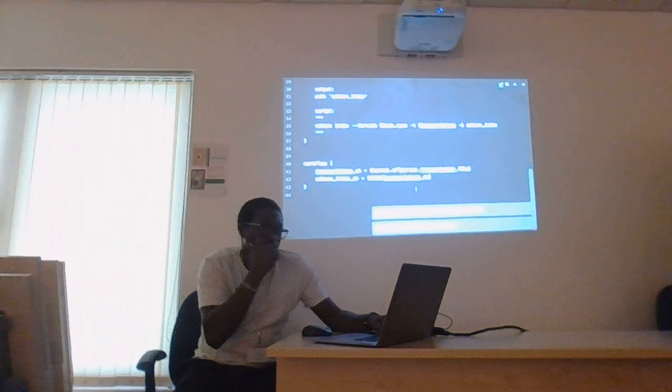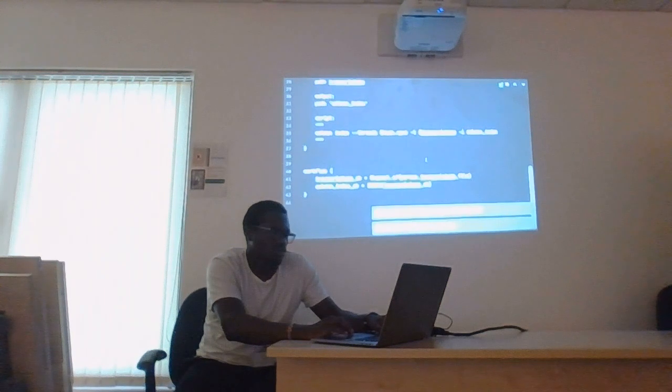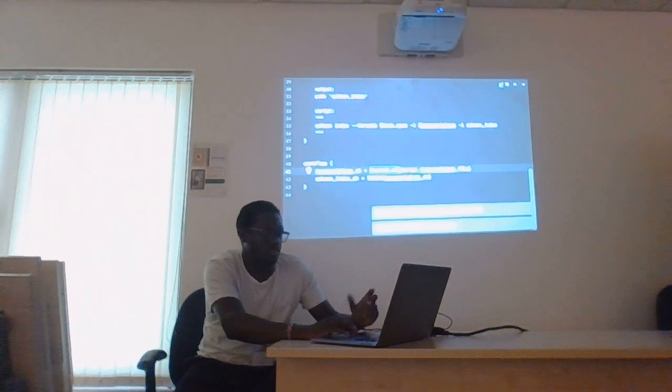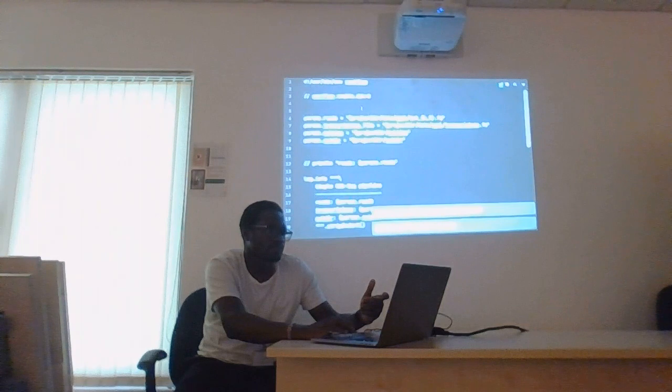But anyway, I know most of you are able to do this correctly. So what has changed for me is that I now define this channel by using a channel factory, a factory channel called channel of, and then I give it the name of my parameter, the value of my parameters file.